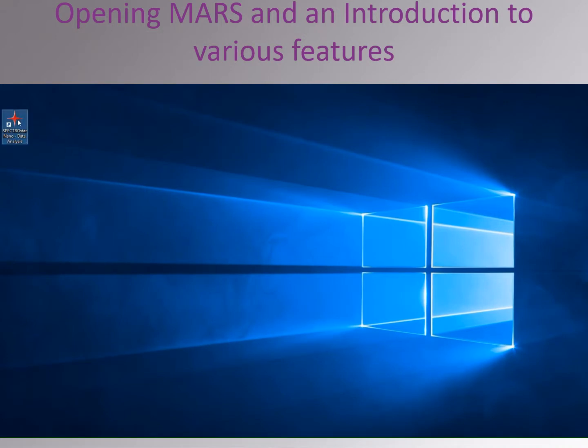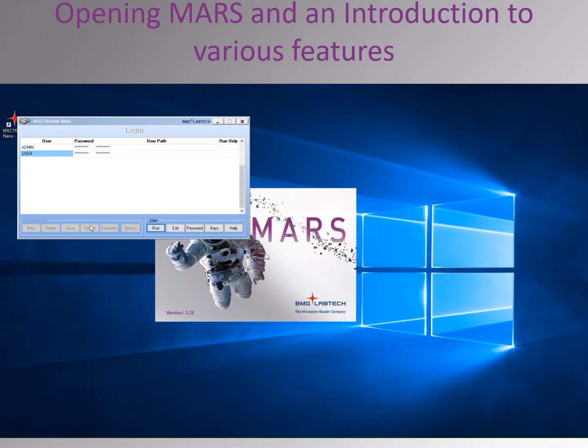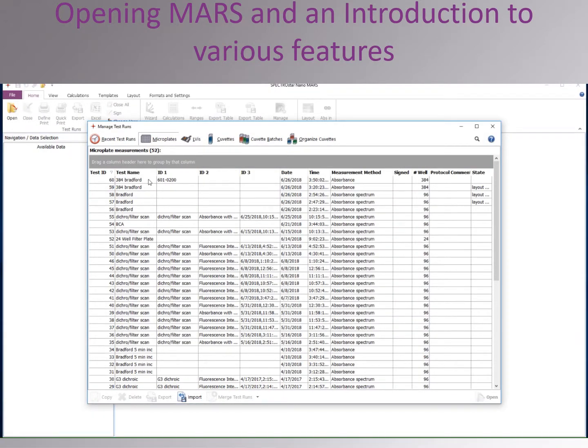Upon opening Mars from the desktop icon, you will first be prompted to select an account to use. Highlight your selection and click Run. Depending on the number of tests in your database, it might take a few seconds to open the software. When Mars opens, you will see the Manage Test Runs window.